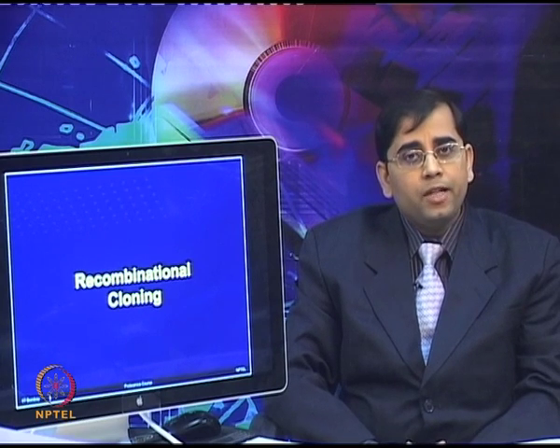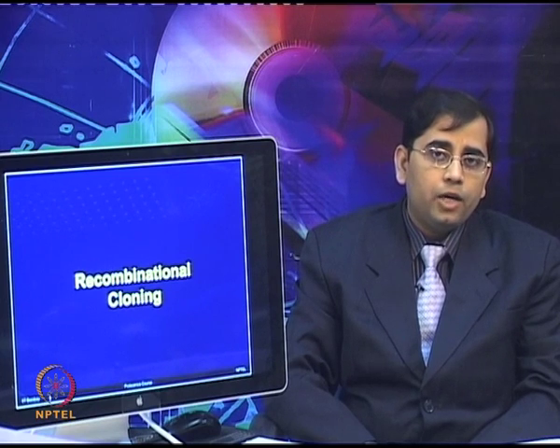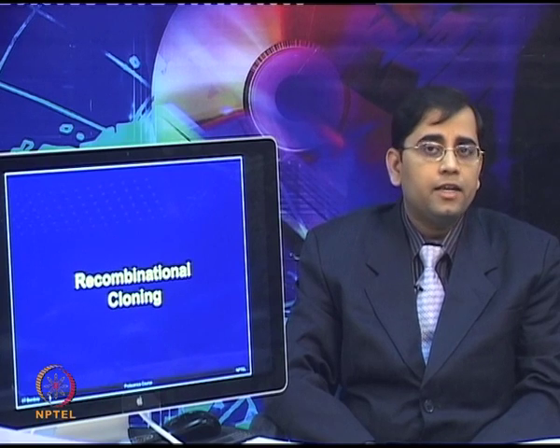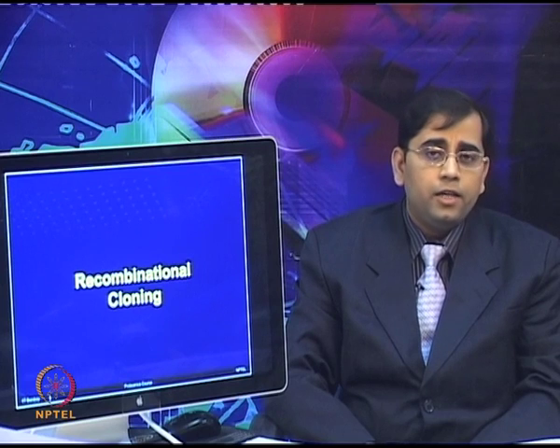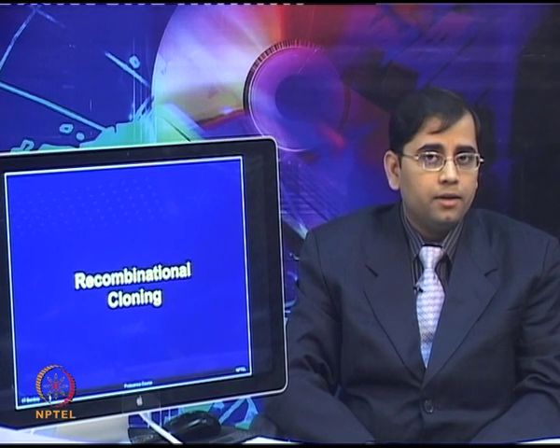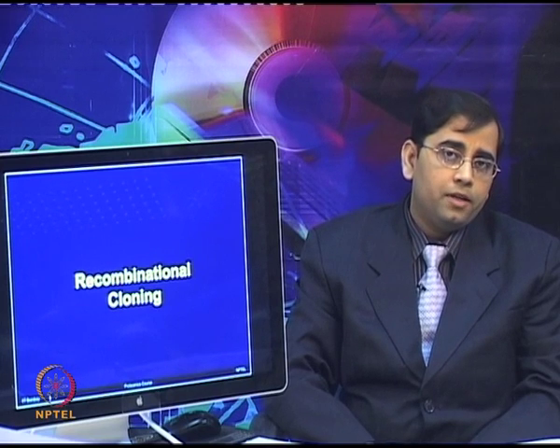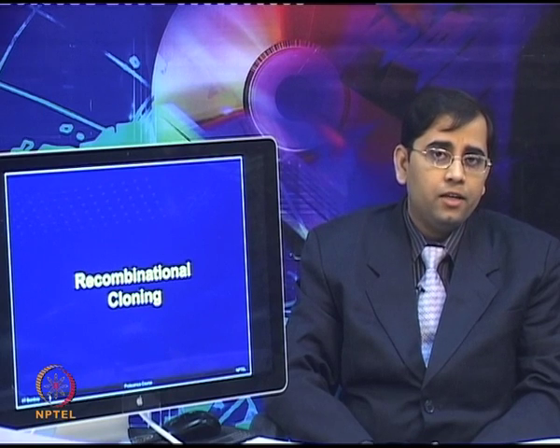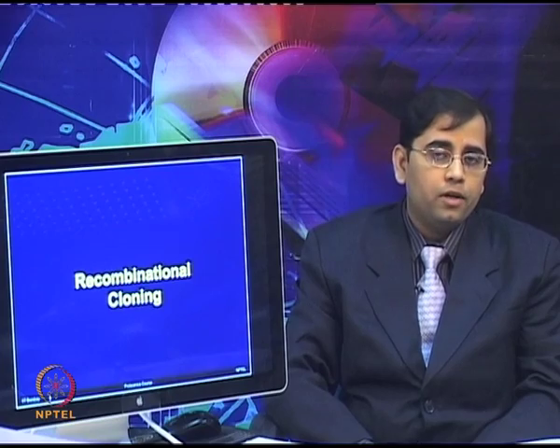The common site-specific recombination technologies include the Gateway cloning system from Invitrogen and the Cre-based technology from BD Clontech. In our discussion on recombinational cloning, I will focus more on the Gateway system. It is more so because of my own familiarity using it in my own research, but both systems can be used for recombinational cloning.